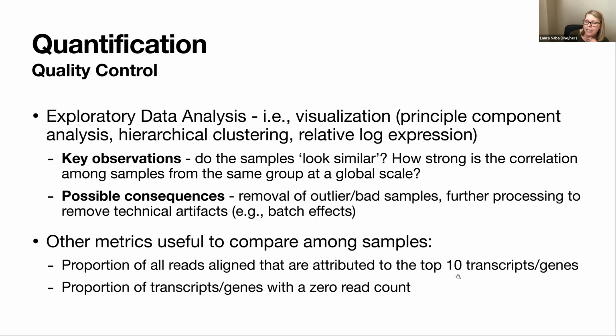In this top 10 transcripts, a lot of times this is really interesting, especially in the context of the total RNA fraction, where you can get the majority of the reads aligning to something non-coding, or even to RNA that wasn't washed away with the filtering process. And so that has been a good quality check for us.